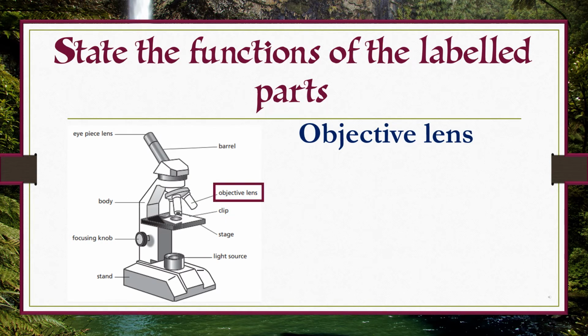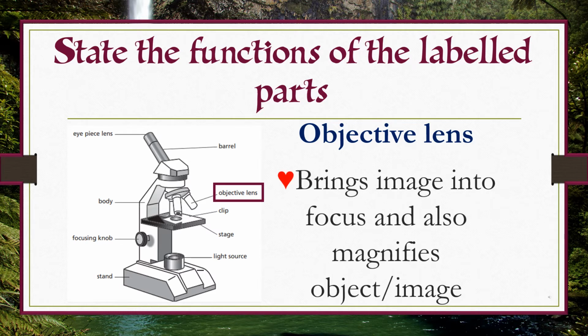The objective lens. These bring the image into focus and also magnify the object or image.